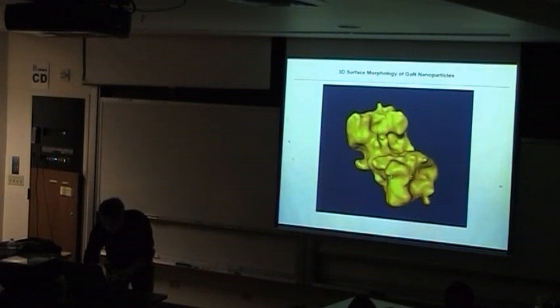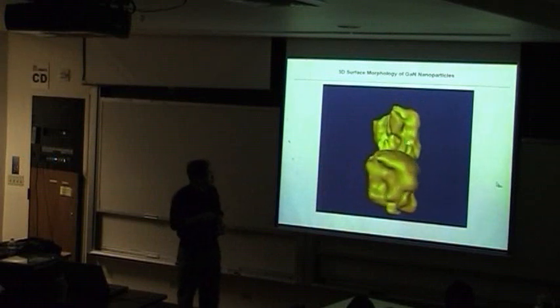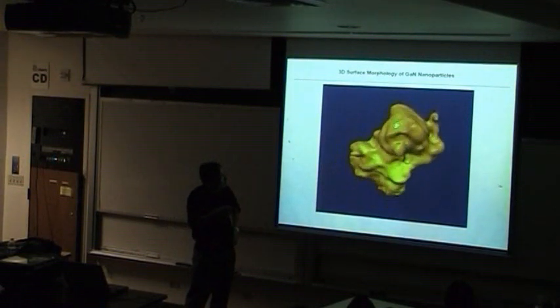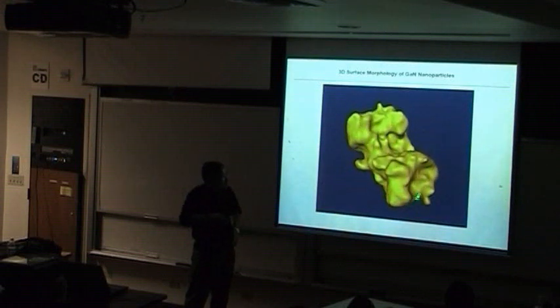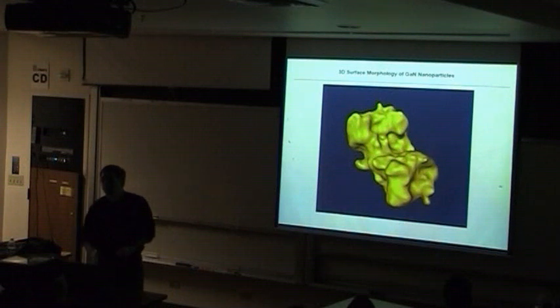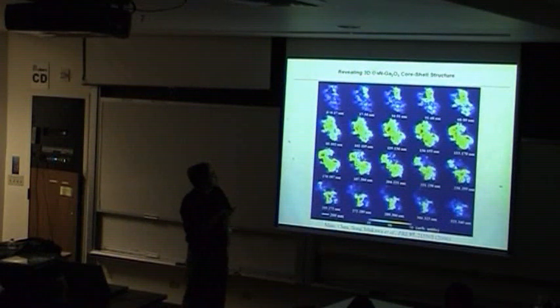I'm going to show the movie. And overall, this size is about 800 nanometers, and at least 300 nanometers. You can see these many platelet structures, and it's very consistent with SEM. Now, the advantage of this technique is that because we use X-rays, we can see the internal structures. And we believe this is the first time revealing 3D gallium nitride, gallium oxide core shell structures.